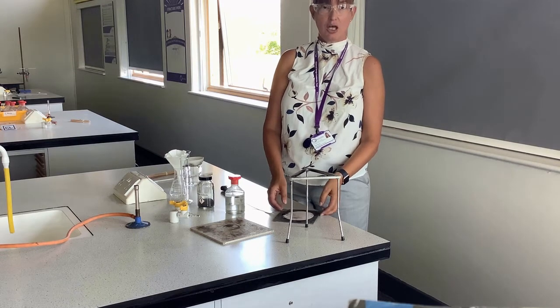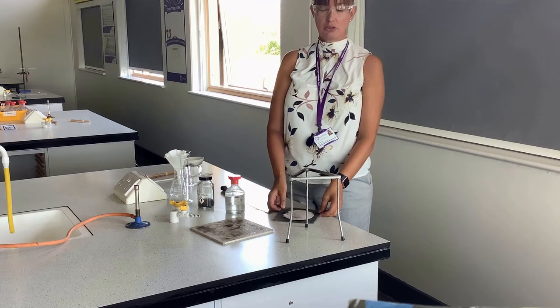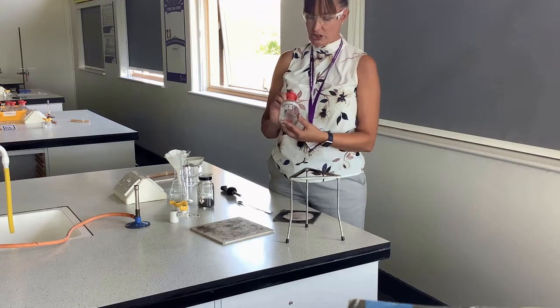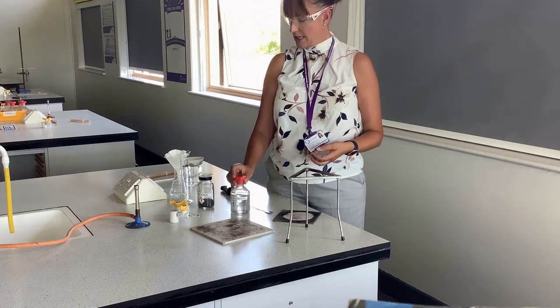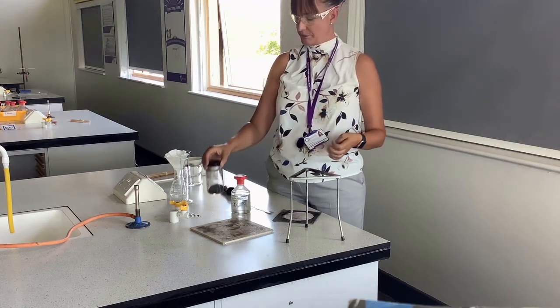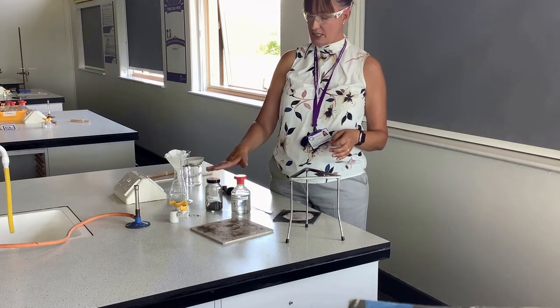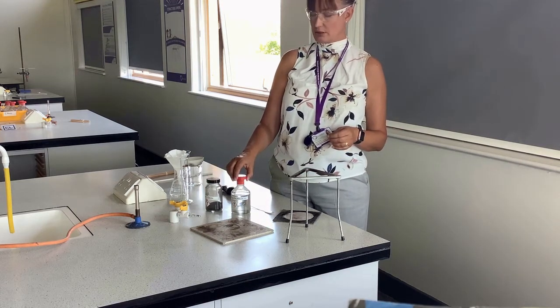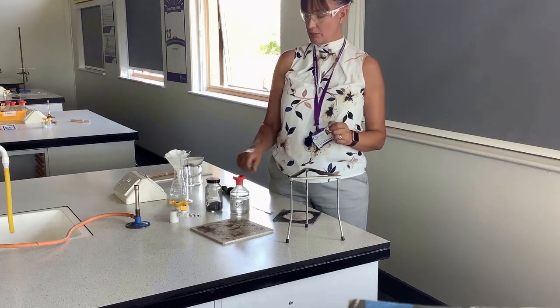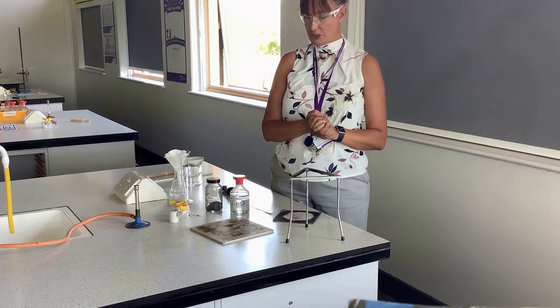Hello, my name is Mrs. Kershaw, and today we're going to look at the required practical for making soluble salts. This is an acid-base reaction, so for this one we're going to use our sulfuric acid, and for our base in this case we are going to use copper oxide. Now the sulfuric acid and the copper oxide will react to form the salt copper sulfate. But as you will have seen before, copper sulfate is a blue solution that's soluble in water. So in the second part of the practical we will need to remove the salt from the water.